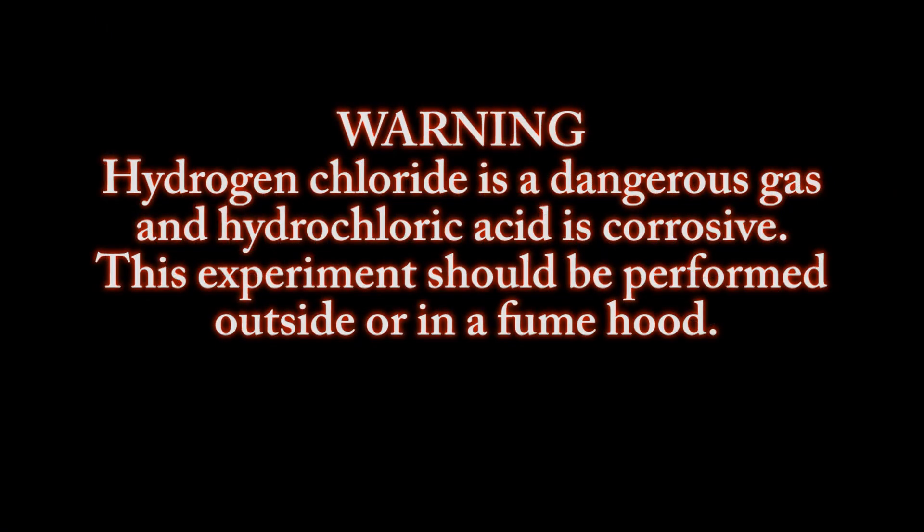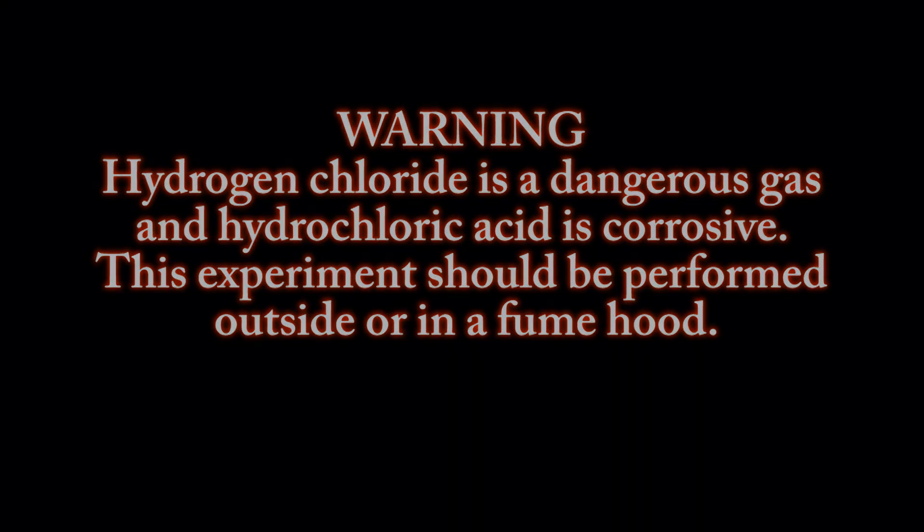Hydrogen chloride is a dangerous gas and hydrochloric acid is corrosive. This experiment should be performed outside or in a fume hood.